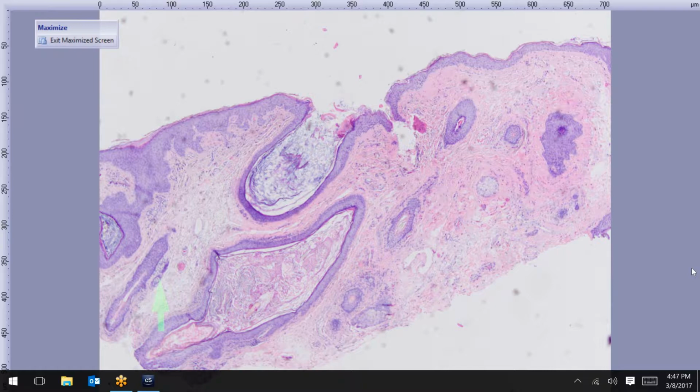So some of the possibilities for this can be a cluster of acne comedones. It could be a nevus comedonicus. And somebody put down the correct initials, Favre-Racouchot. So this was Favre-Racouchot.